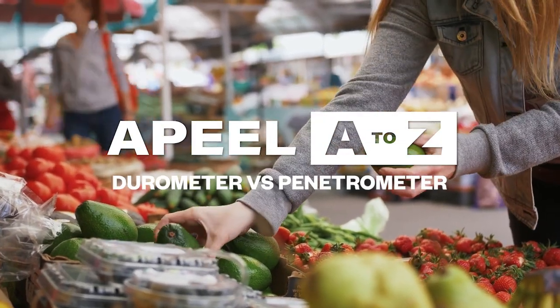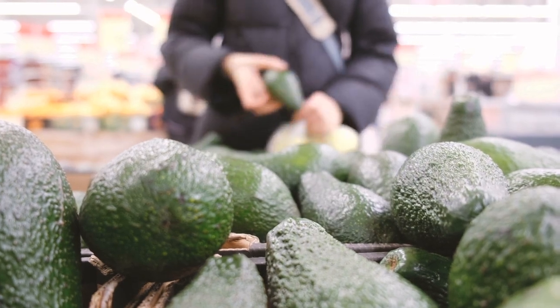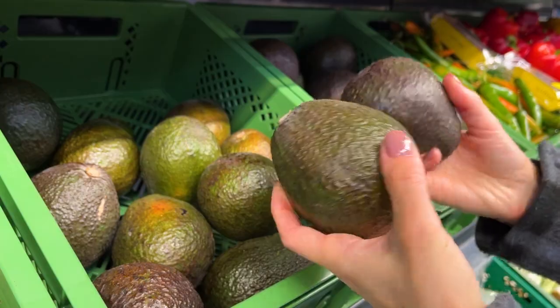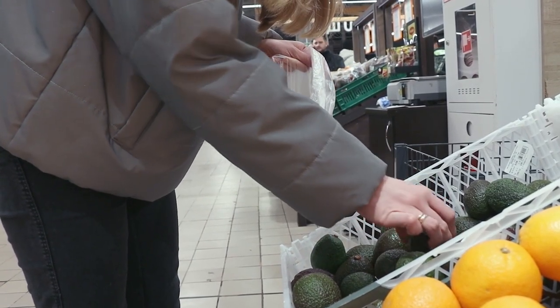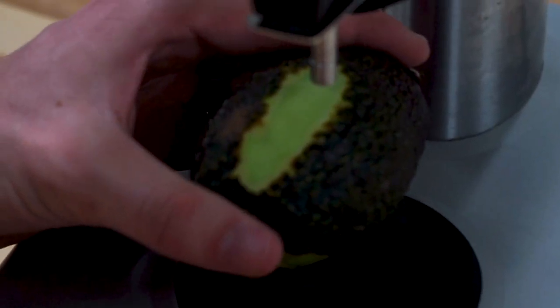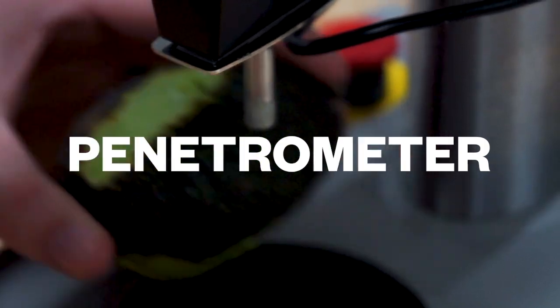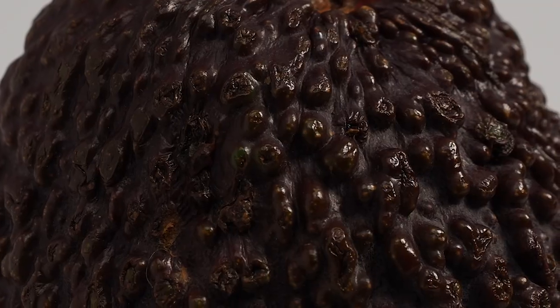How do most shoppers determine the ripeness of an avocado? That's right, the old-fashioned squeeze test. Unfortunately, most shoppers will tell you, despite their best frisking, it's incredibly difficult to find avocados that are just right in the store. When it comes to measuring avocado ripeness, the industry standard has been the penetrometer. However, despite its wide adoption, it's actually not very accurate at measuring ripe fruit.